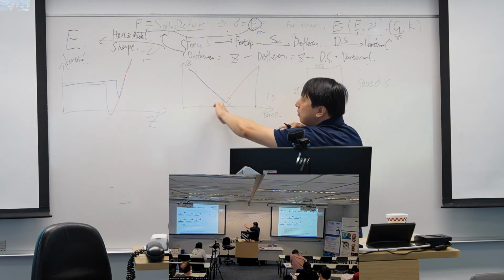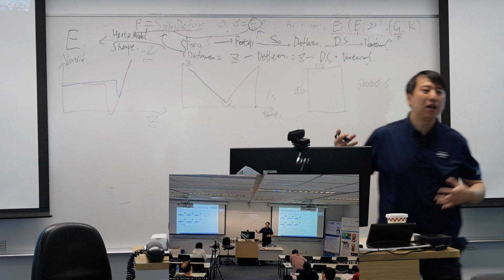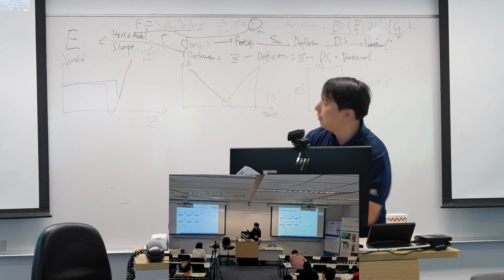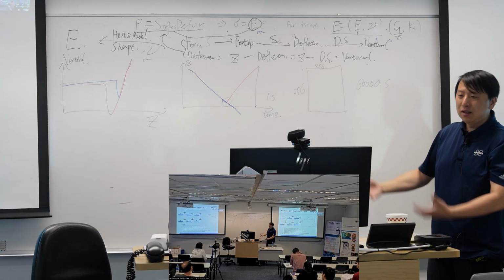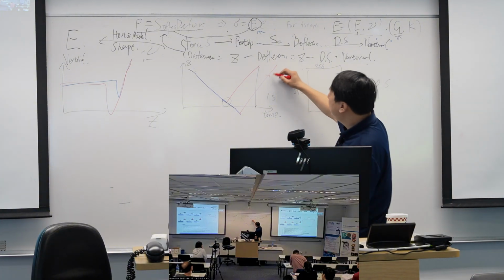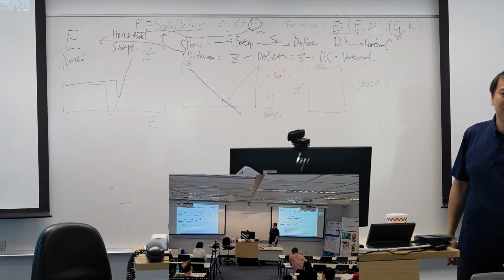You want this probe to turn around at this point, but it cannot always follow your order. It will go down, and then it may go up. That's the real force curve when you do it fast.